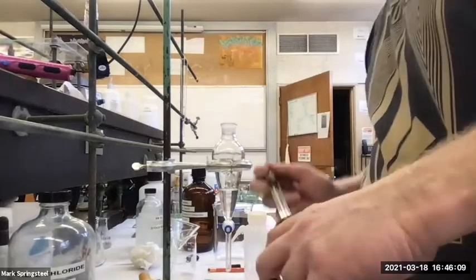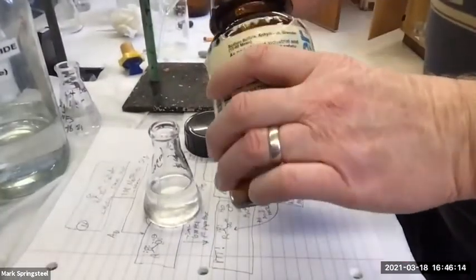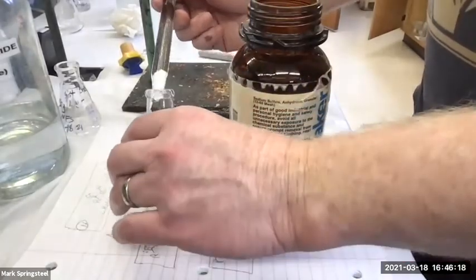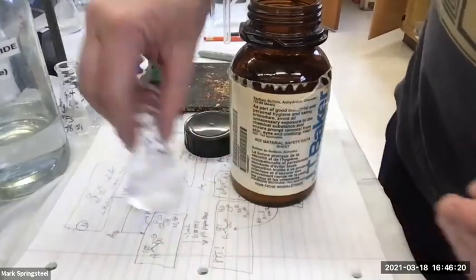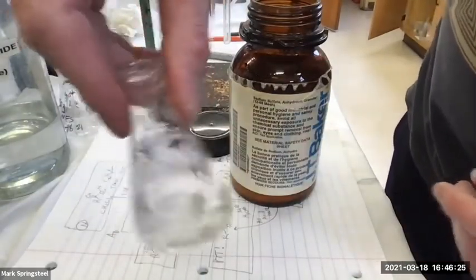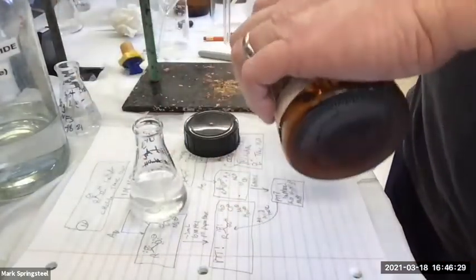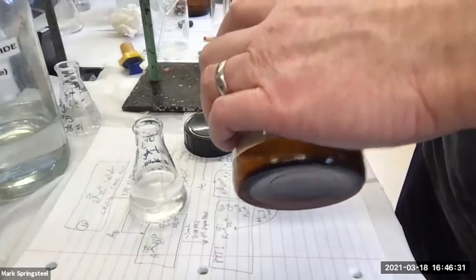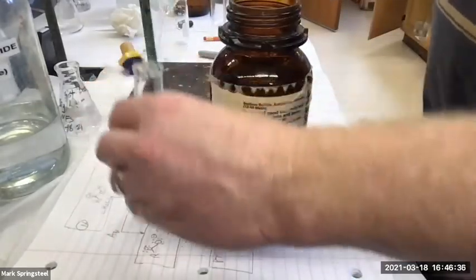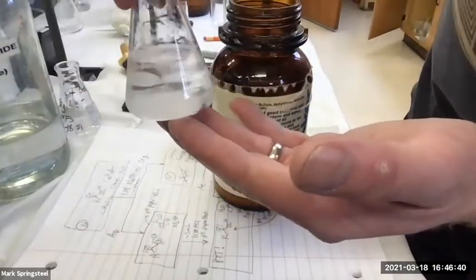Let's do it. So I just start adding sodium sulfate, and as I add it, it should clump at first, and then it'll stop clumping. It'll be more granular. So it's clumping when it's hydrating. Right now, it's basically one big clump. Sometimes if you have a lot of water, it won't even clump at first. It'll make a gel kind of thing. You see these little gel balls, and you keep adding, and then it starts clumping, and then finally it's not clumping, it's little grains. And then you're going to notice it's going to clear up, hopefully you see it.